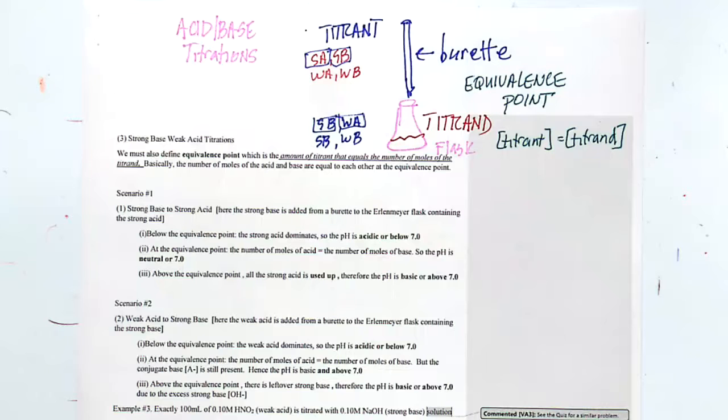So that is 50 mils. What the? It turned. Now it's fine. Oh, this titration didn't work. I don't think it worked. We were all excited for a minute. What's wrong with this color? It's too dark. Too dark is the right answer.